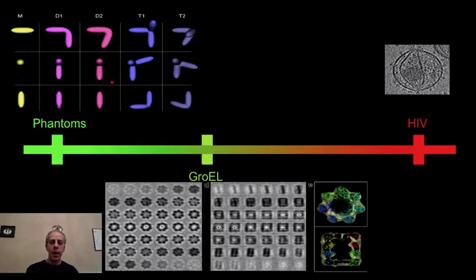I'm happy. The next step, because it's almost impossible to do a perfect simulation of everything that is going on in the microscope, is you take particles that for some reason we know their structure. Maybe because they are larger than the HIVs, maybe because they are more rigid and they could be acquired with other technologies.